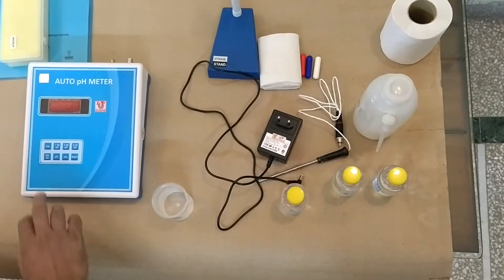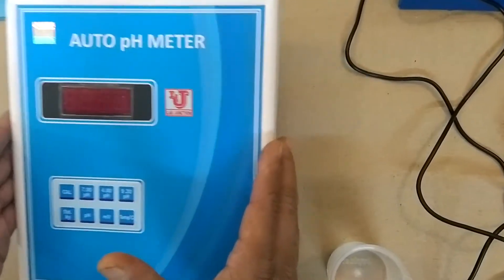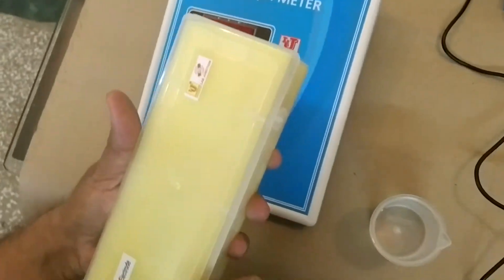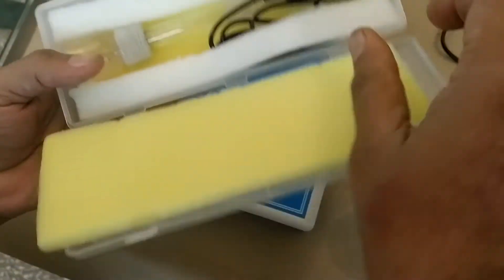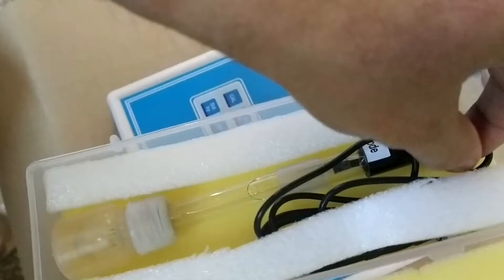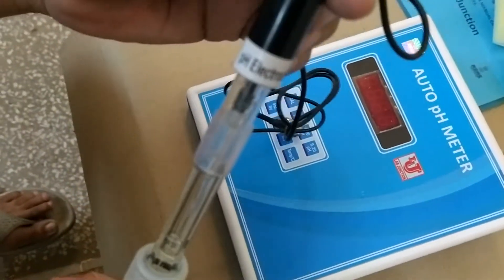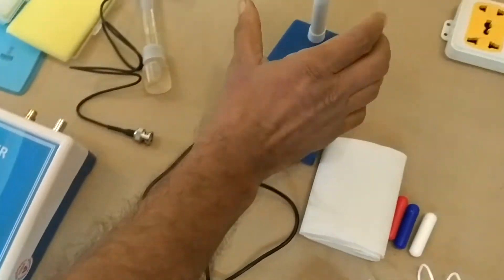This is the Layered Junction Auto pH Meter. This is Unit 1. This is the pH electrode for the pH meter. This is the stand.